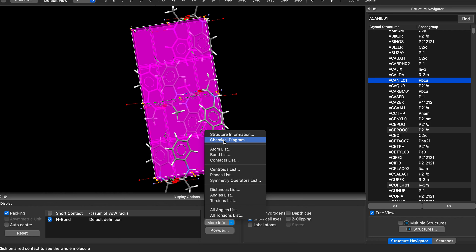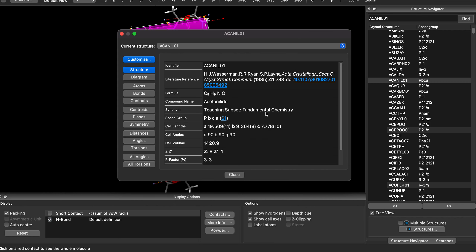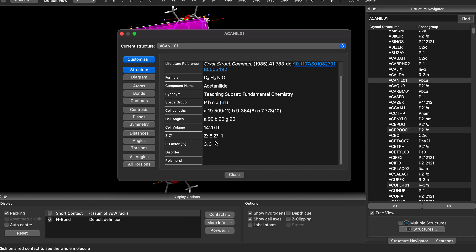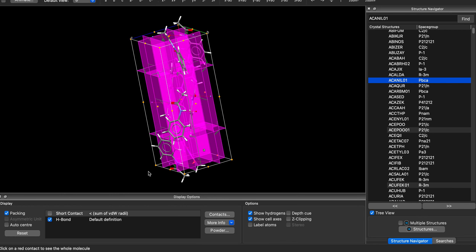Another thing is you can go here to see chemical diagrams. It contains a lot of metadata, like where this structure comes from — for example, the source paper, formula, cell length, and Z prime. Sometimes it will also tell you whether there is a disorder. Overall, it's a very useful tool, very useful for visualization.